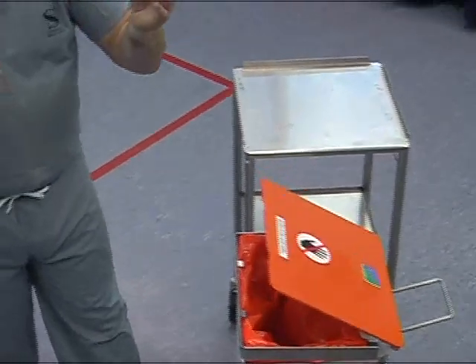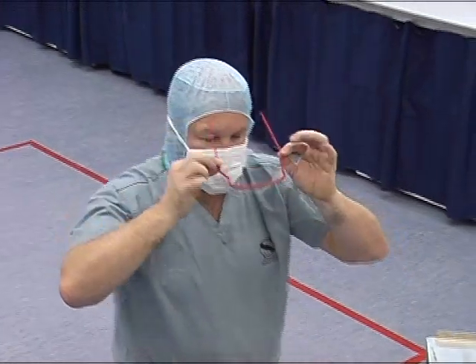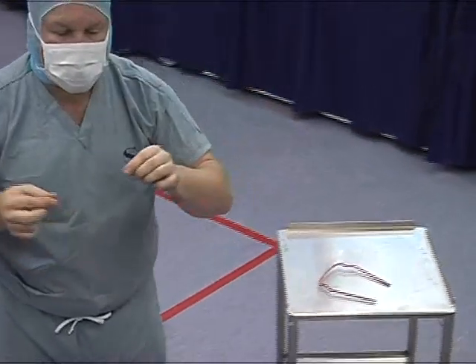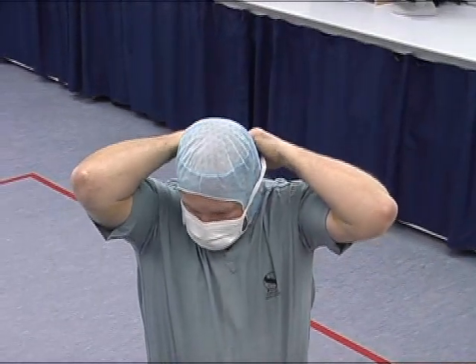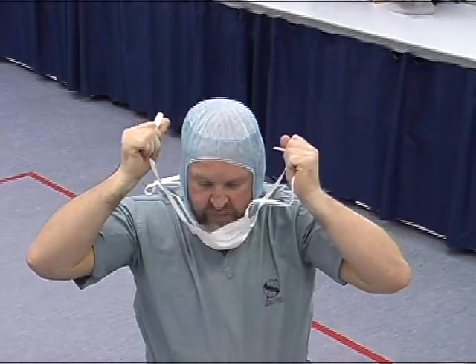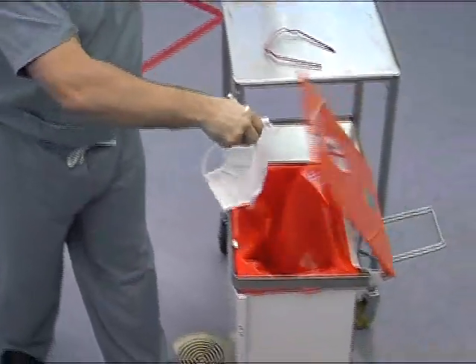If safety glasses have been worn, remove them by the legs rather than by the front of the glasses. Remove the mask by pulling the ties at the back of the head. The mask should then be disposed of, holding it by the ties only, in the correct rubbish bag.